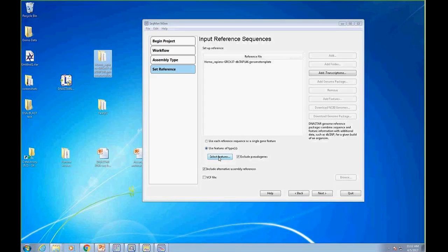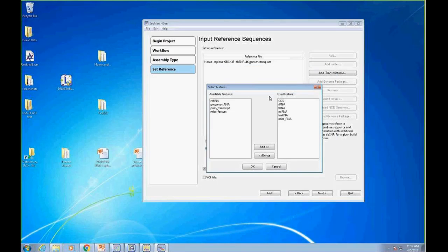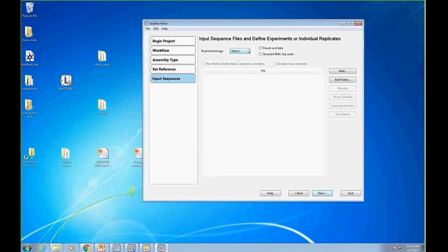Now I can also pick, when we do RNA-seq, we want to quantitate expression against the annotations that are on the genome. So we have an interface here that allows me to pick the subset of features that I want to annotate against. In many cases, it's just the CDS sequences. Some genomes, though, are annotated differently, and it's genes and mRNAs that I want to quantitate against. So you have some selection. I might decide I don't want to quantitate ribosomal RNAs. So you can select what you want to quantitate against, move on to the next step, which is to load the sequence data.